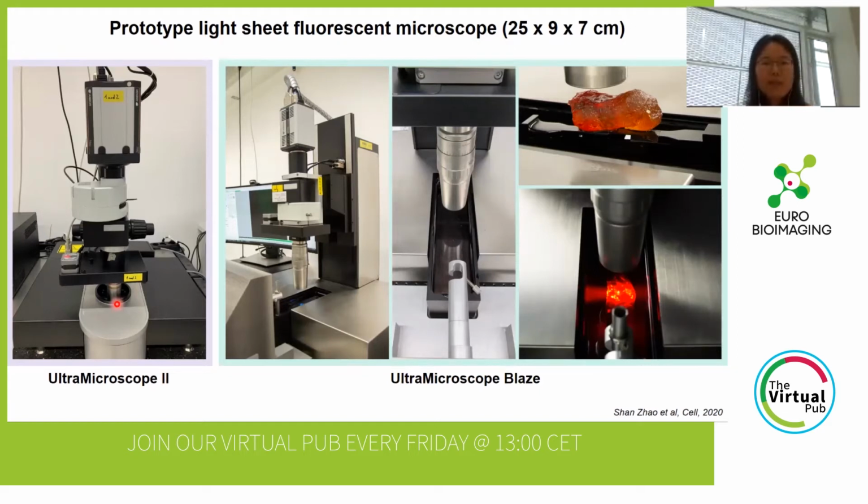To address this problem, we collaborated with the LaVision Biotec company to co-develop a prototype light sheet fluorescence microscope. This microscope is shown like this, and it has a much bigger sample chamber, about 25 by 9 by 7 centimeters.